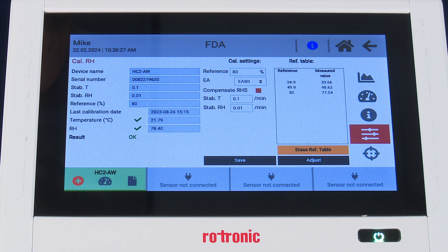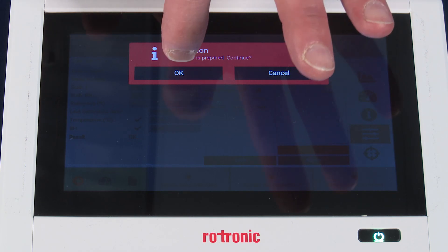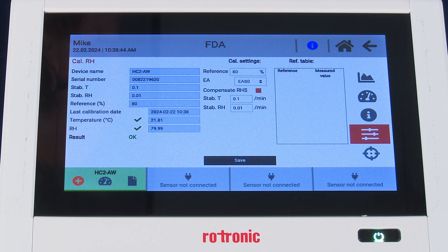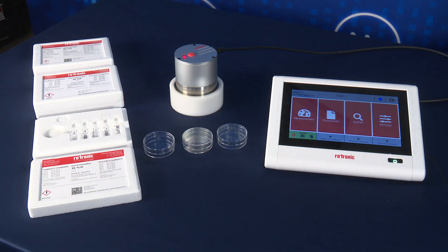It is at this time that we can go ahead and press the adjust button, which will then adjust and calibrate the humidity probe. We want to confirm OK. You have successfully adjusted or calibrated your Rotronic Water Activity Probe. That completes the calibration procedure.